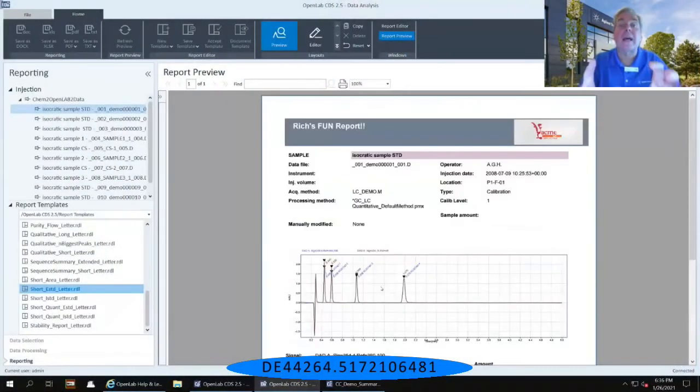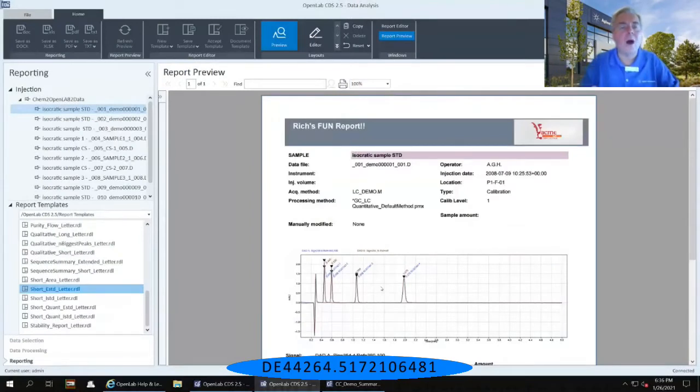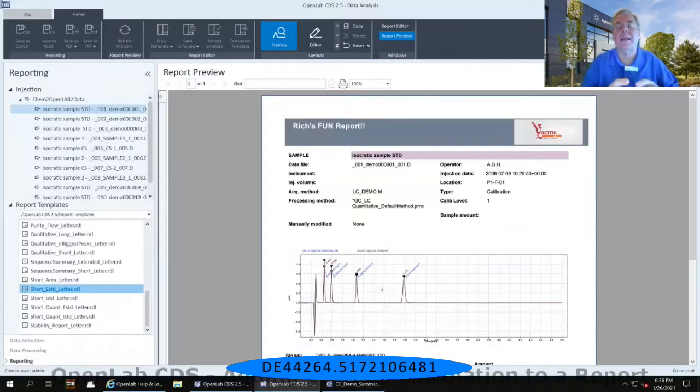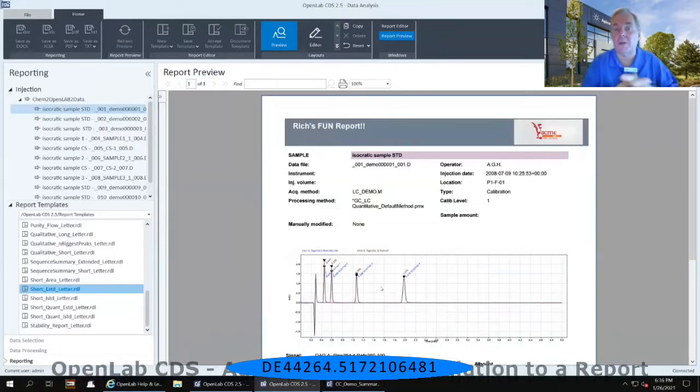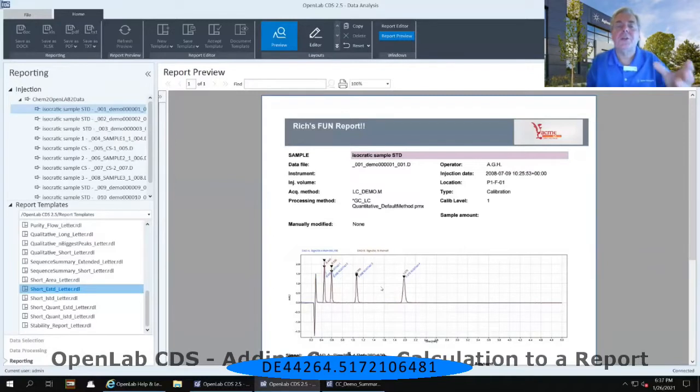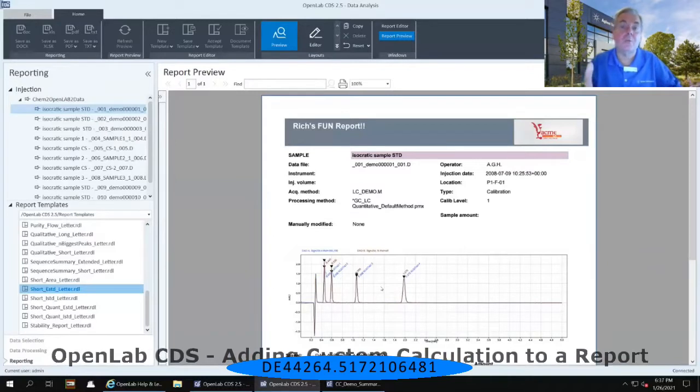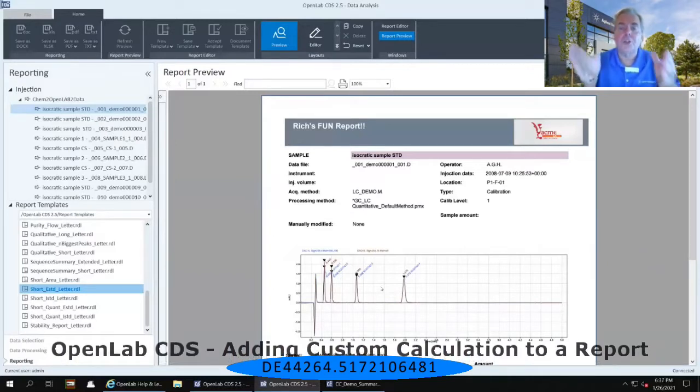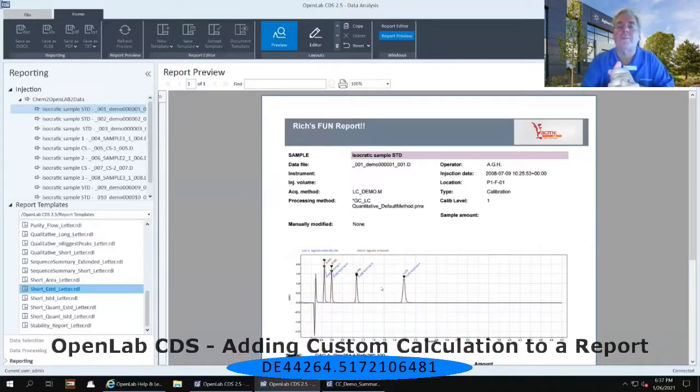So we're almost there, but I want to add one additional field. Because we spent so much time creating that custom calculation and that custom calculation file, I would like to add the USP resolution column to this report.